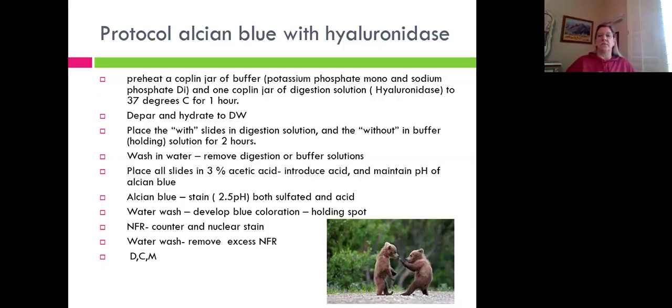It's just the buffers that are used in 10% NBF. So you're going to have 1 Coplin jar of buffer, 1 Coplin jar of hyaluronidase. The hyaluronidase does need to be warmed up to 37 degrees Celsius. So I just zap mine in the microwave for about 10 seconds and I'm good to go. You just barely warm it.